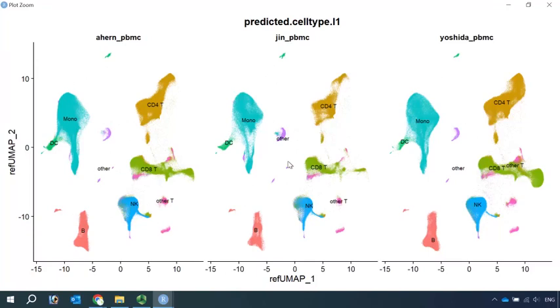So I'm going to stop from here for today's demonstration. I hope my video tutorial can help your large data analysis.